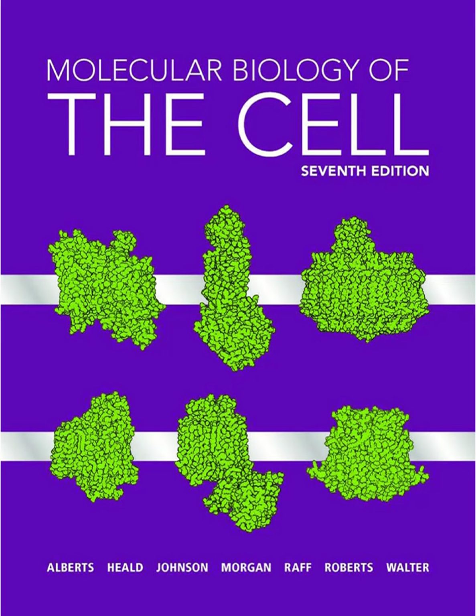This seems like a really powerful tool. It is incredibly powerful. The basic idea is simple elegance. Fluorescent molecules, or fluorophores, absorb light energy at one wavelength, like blue light, say, and then very quickly re-emit it at a longer wavelength.